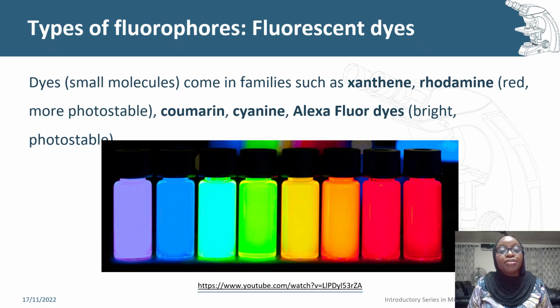We take the first one, the fluorescent dyes. These are small molecules, and they come in families such as xanthene, cyanine.